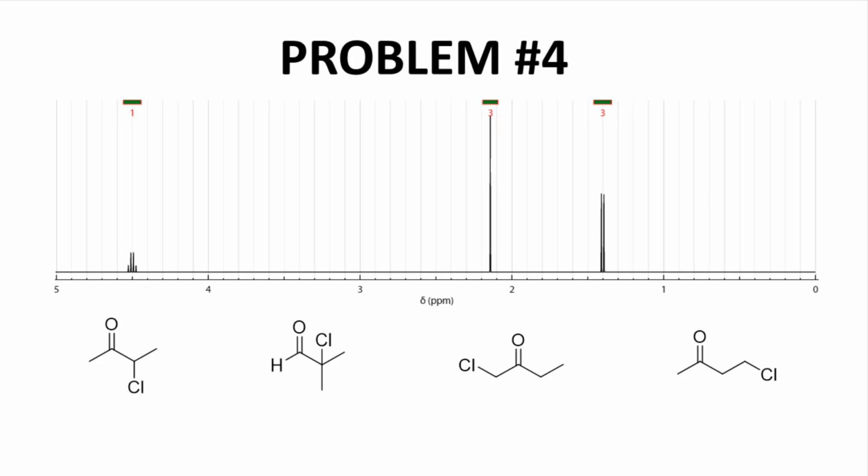So we look at the first structure. Let's see, A. Now B doesn't have anything. There's B and C. So again, this carbon doesn't have any hydrogen, so it won't show anything. But we do have a methyl and a methyl. Hey, at least by our criteria, this could possibly match. It's not unreasonable. Let's go to our next compound.